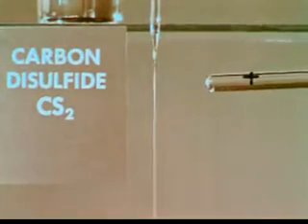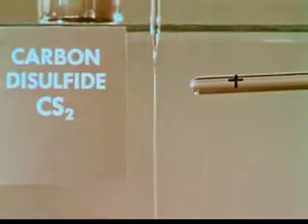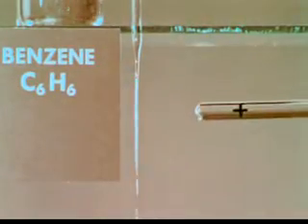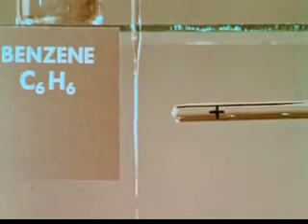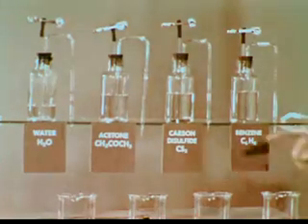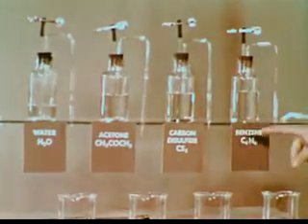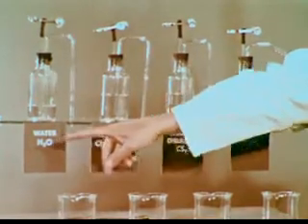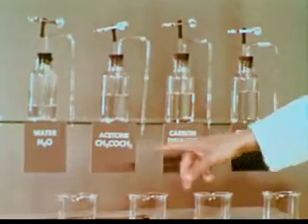Here is carbon disulfide. No effect from the positive charges. This is the same result as with a negative charge. This is benzene. No deflection. Again, the same result as with a negative charge. So we see that some liquids are not deflected by either kind of charge, while other liquids are attracted by both positive and negative charges. Why?